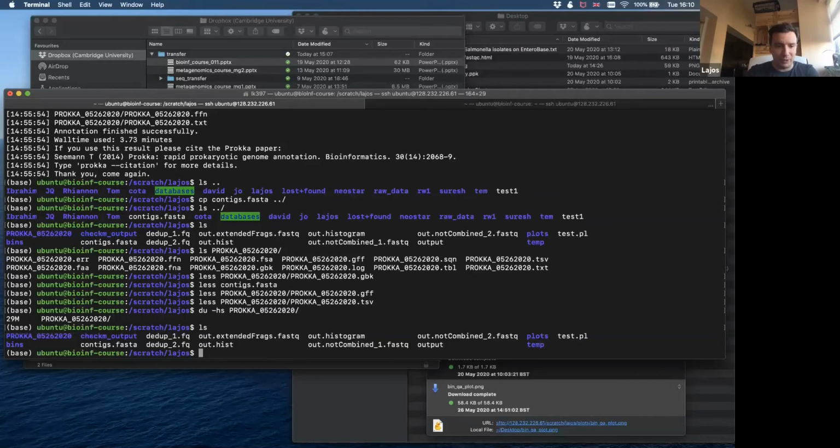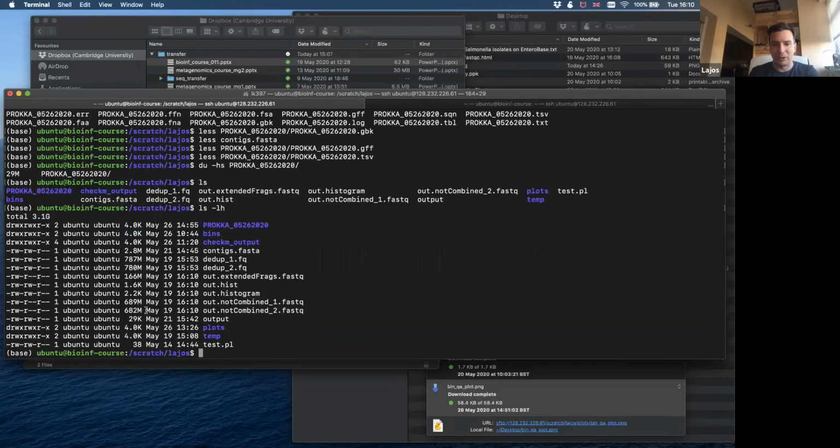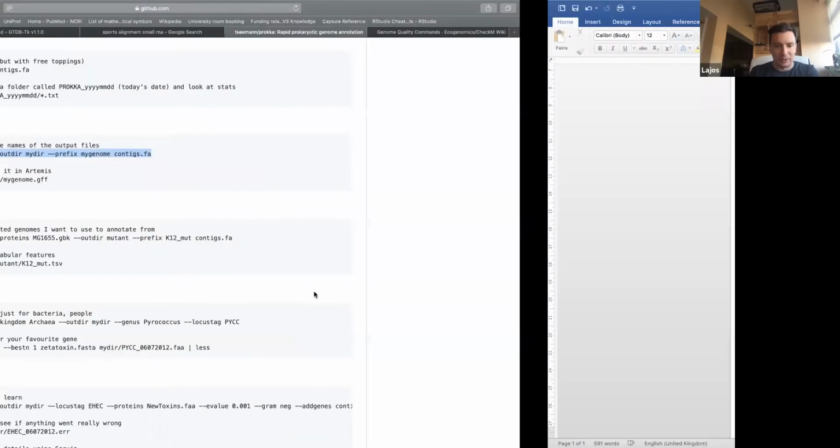the pre-assembly folder. If we are just looking at the files here, we have the deduplicated FASTQ files. We have the merged and unmerged files from FLASH from last time. These are huge, several hundred megabytes. Oh yeah, this is something I have to write into your cheat sheet as well.